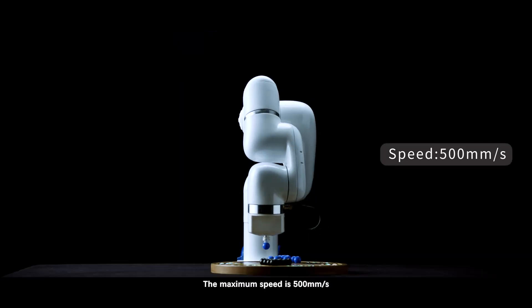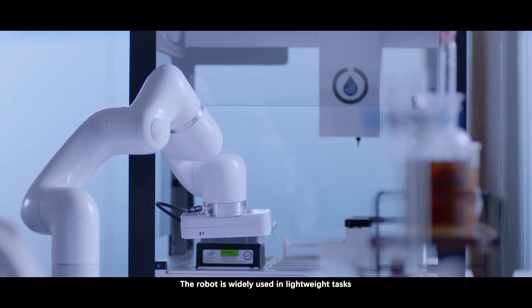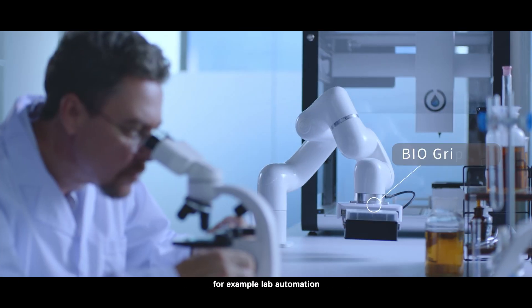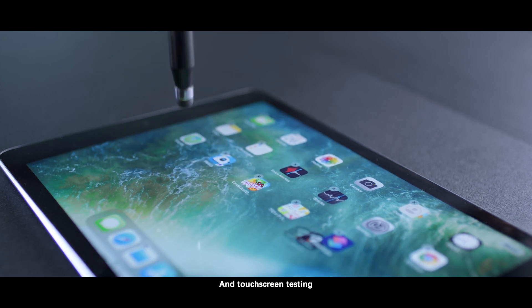The maximum speed is 500 millimeters per second. The robot is widely used in lightweight tasks, for example, lab automation and touchscreen testing.